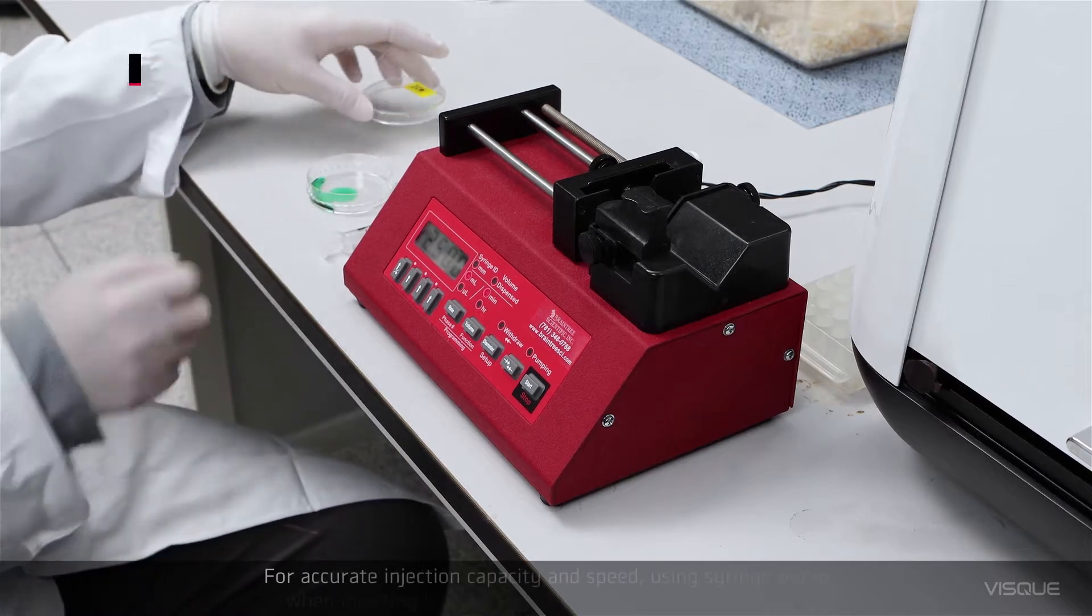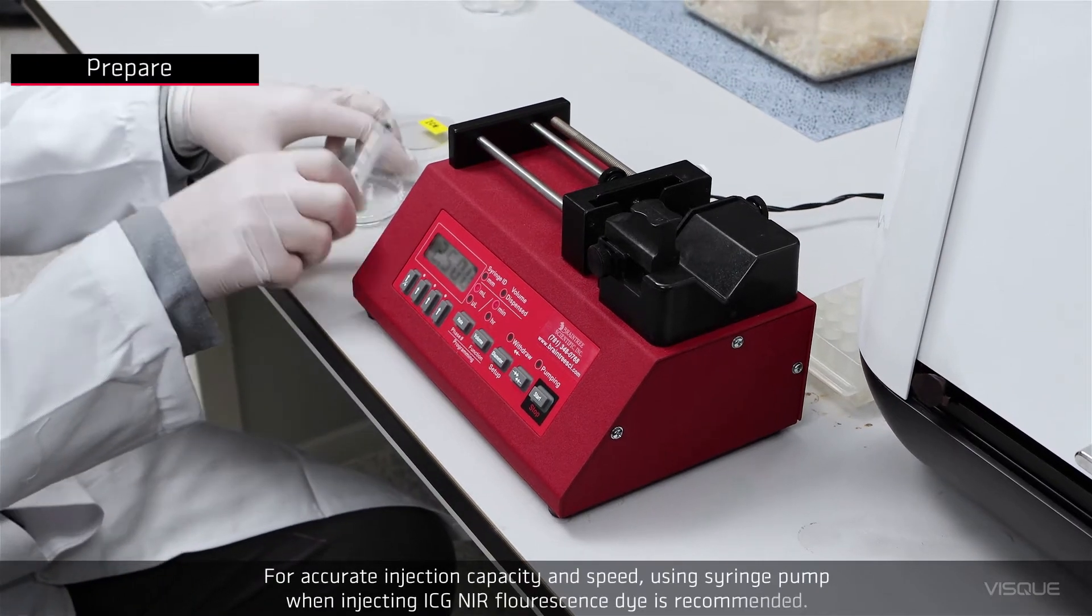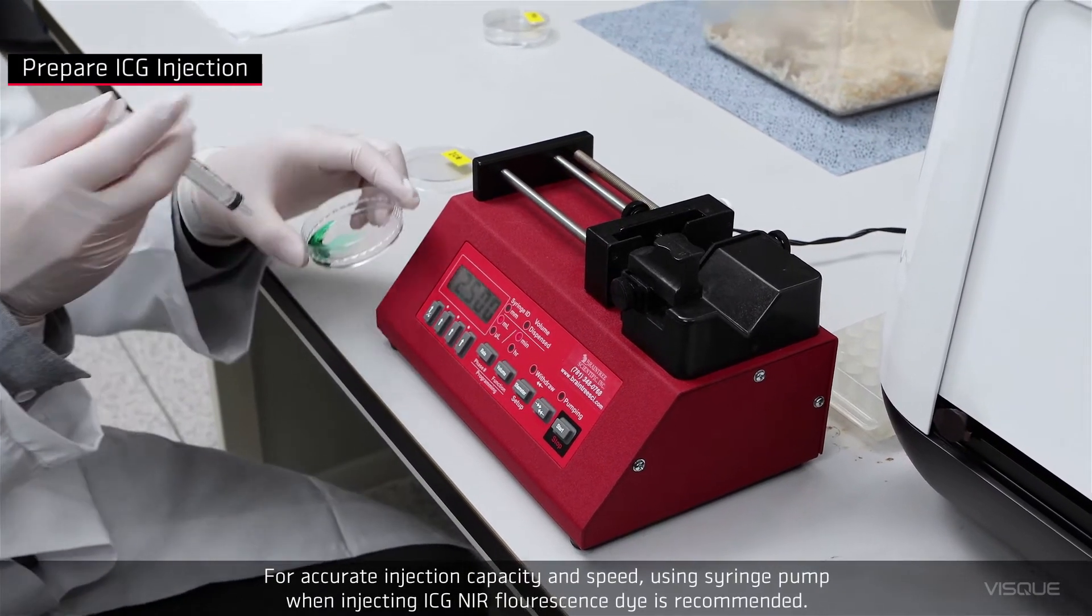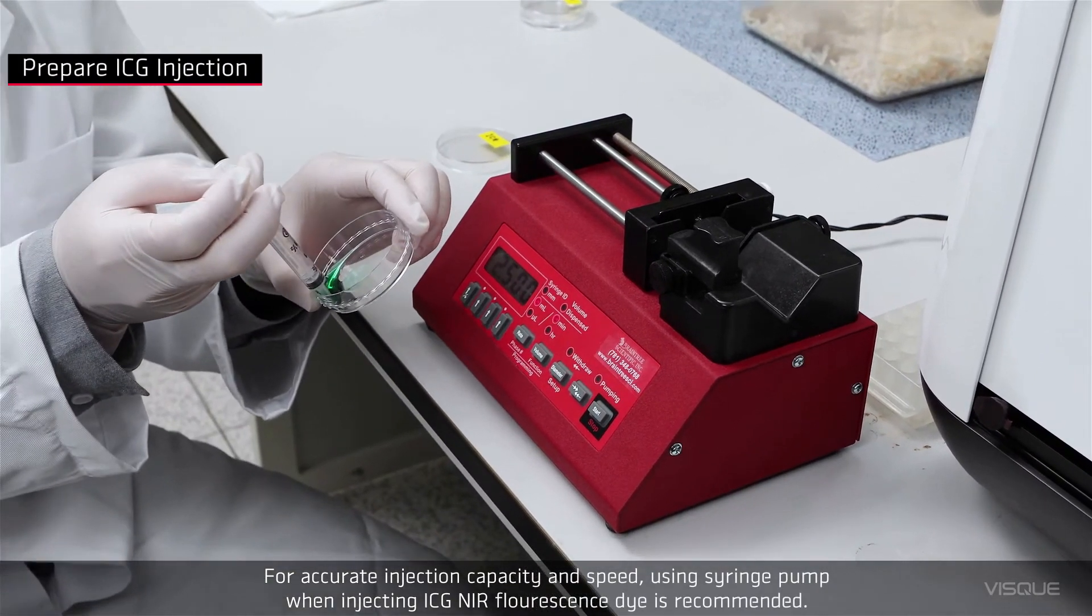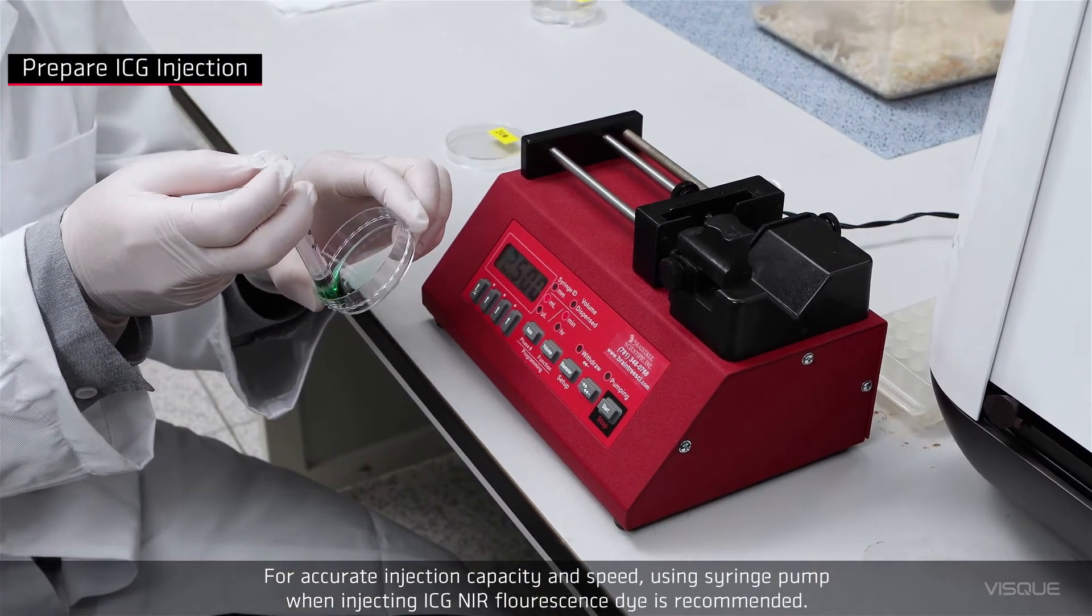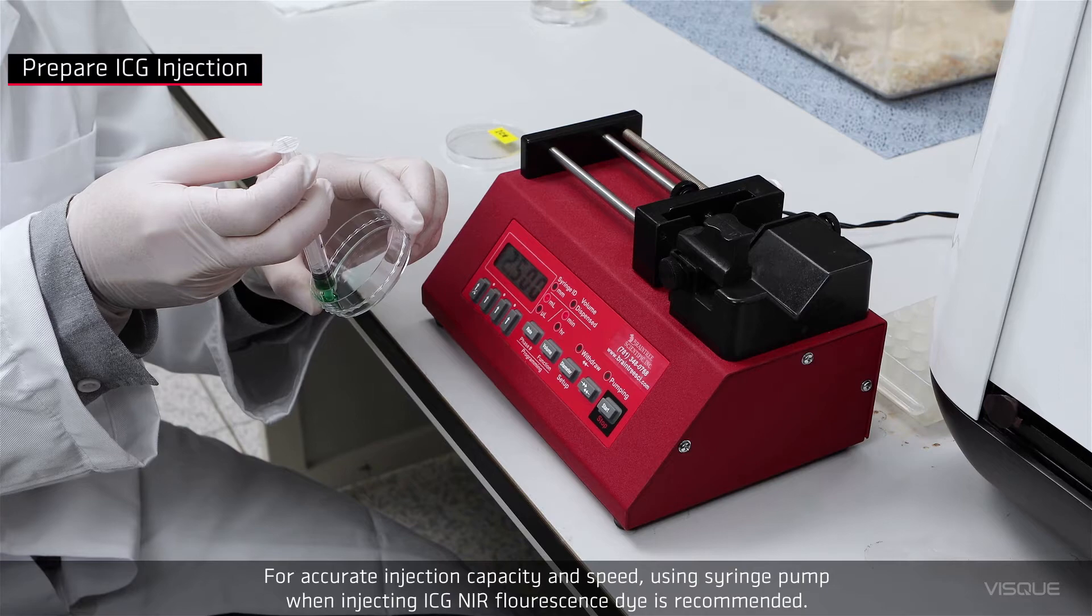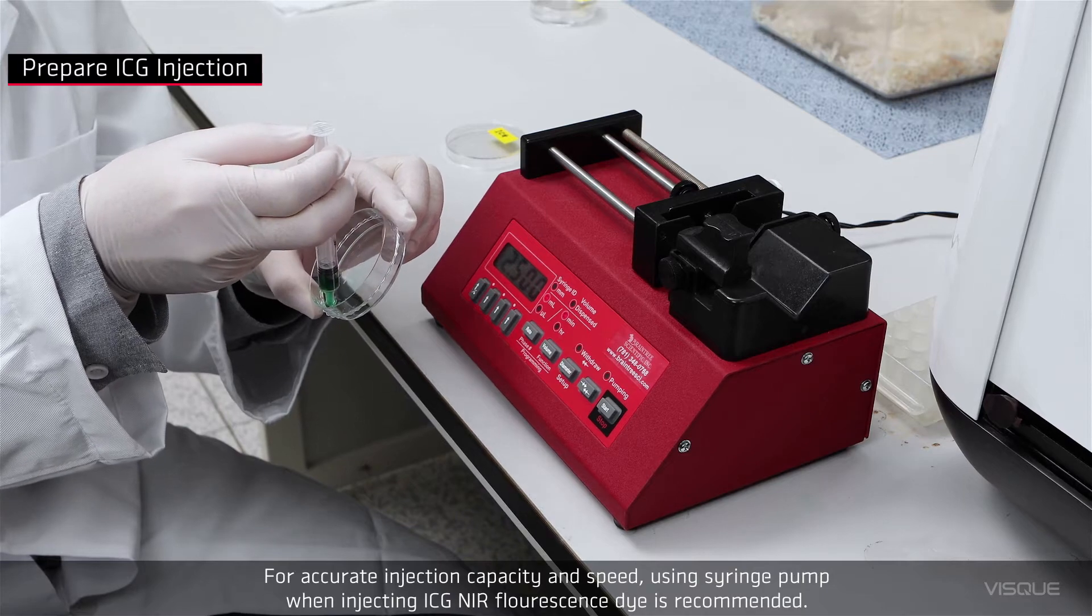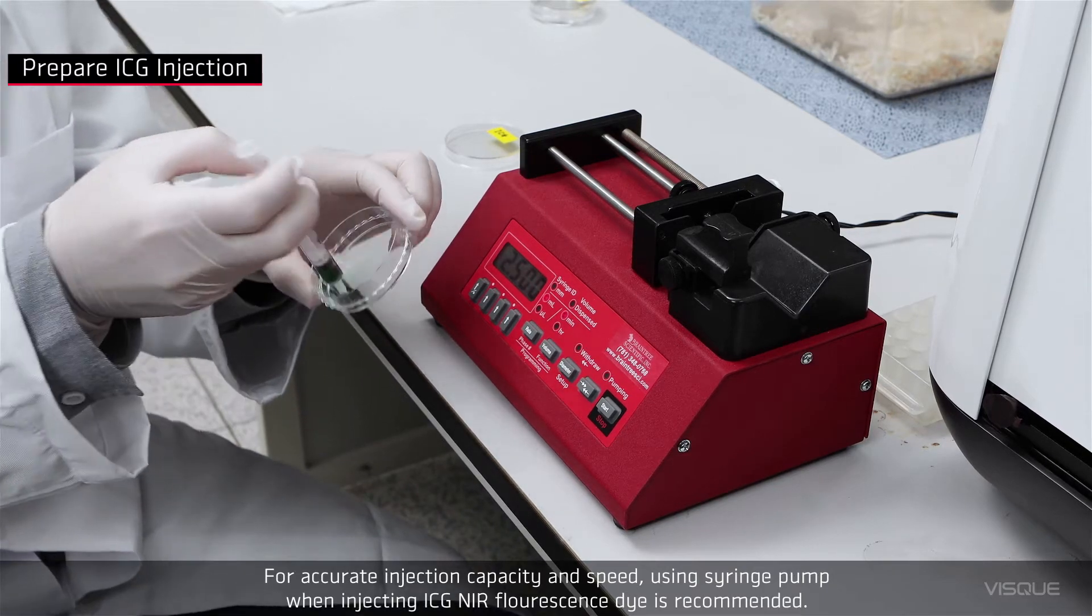For accurate injection capacity and speed, using syringe pump when injecting ICG NIR fluorescence dye is recommended.